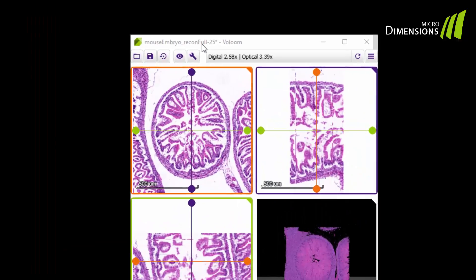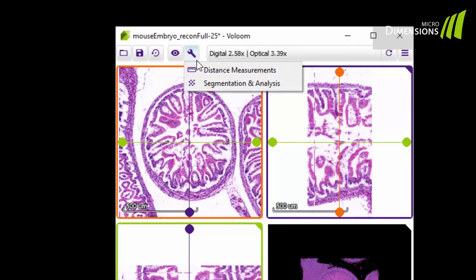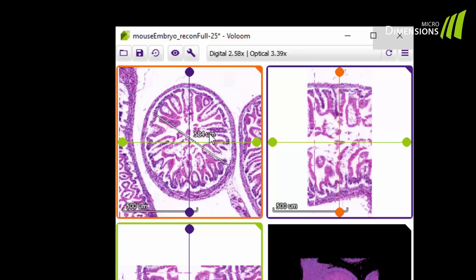To perform simple measurements, you can click on the tools button and turn on distance measurements. Just click and drag your mouse over the structure to be measured. If you don't need a measurement anymore, you can select it by clicking on it and hitting the delete key.